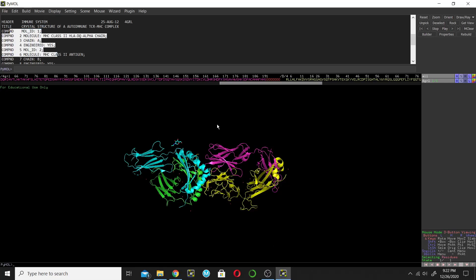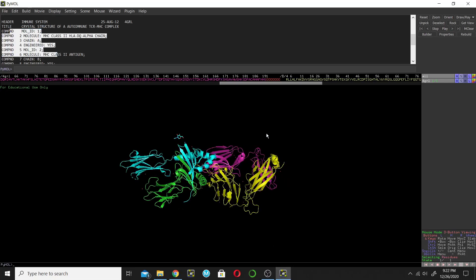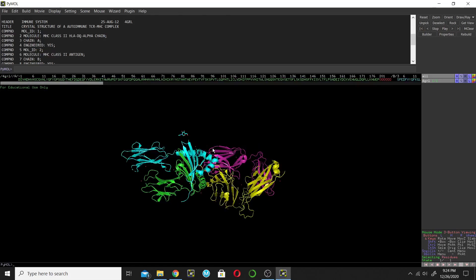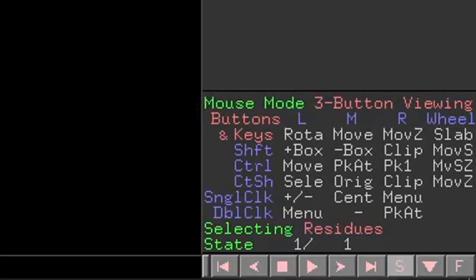Let's go back to PyMOL. How to delete? There are different ways — I will teach you one by one. The first method is by selecting the chain, and the second method is by directly deleting the chain. Before that, I will explain this corner of the interface a little.